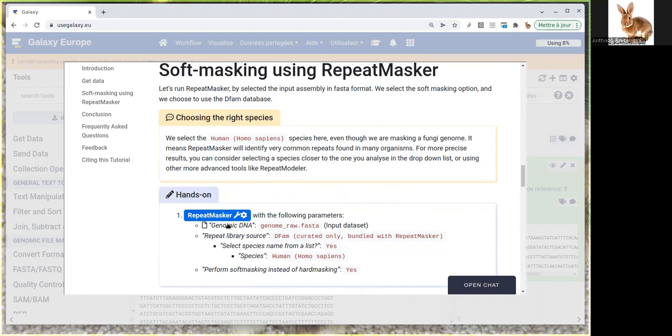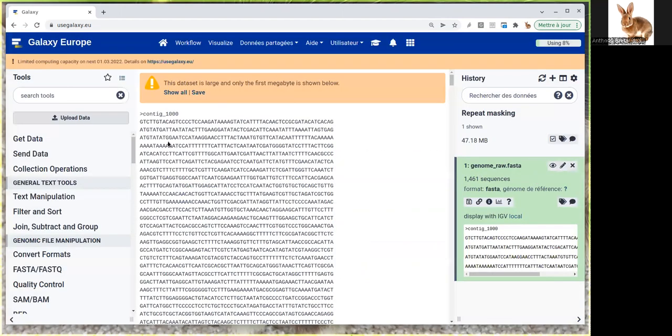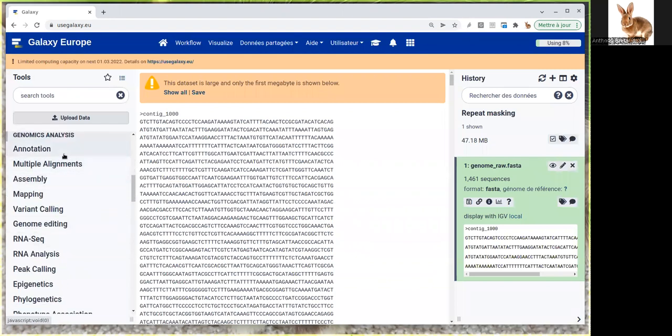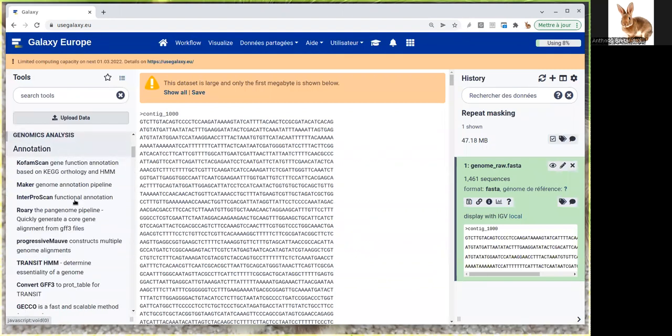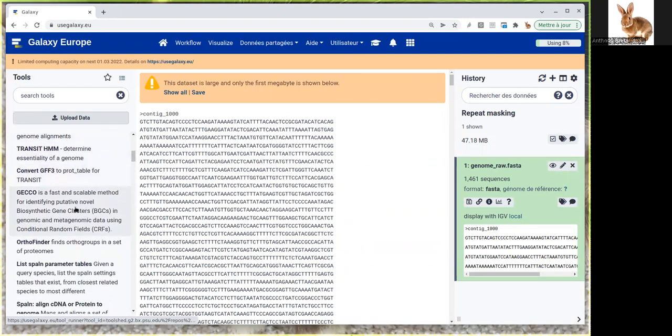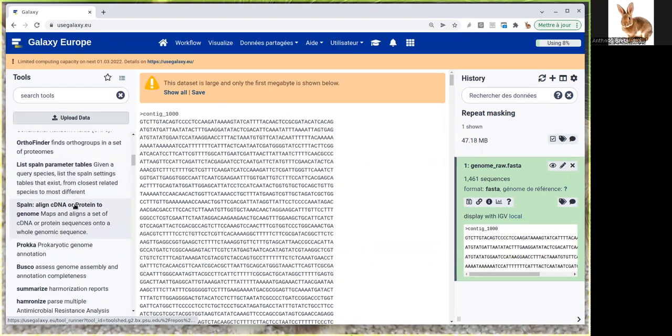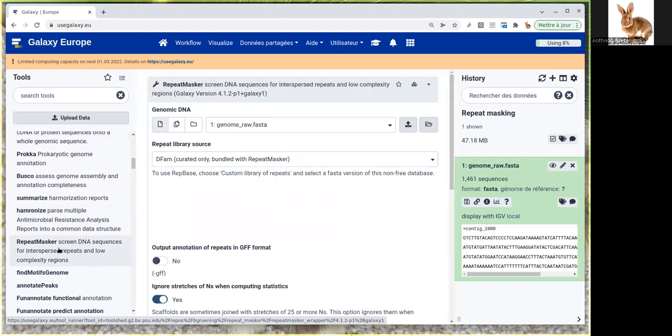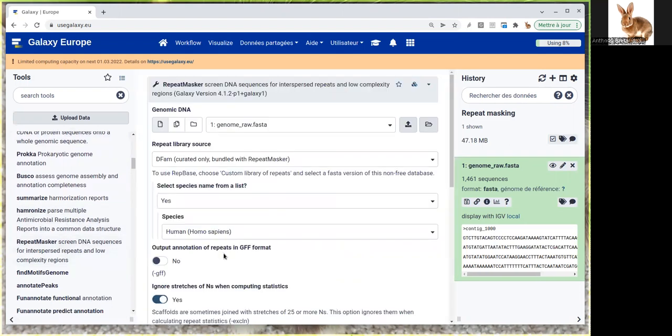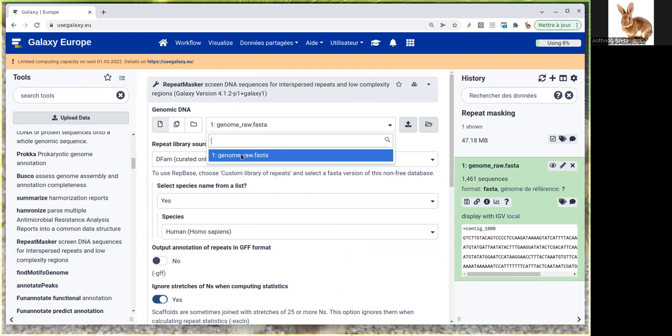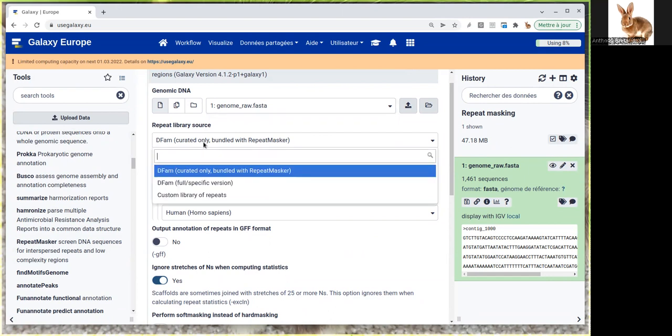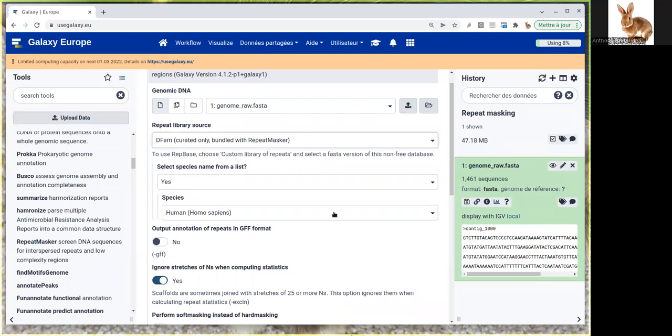The next step is to run RepeatMasker on this genome. You can launch it by clicking here or find it in the annotation section. We're using the latest version, and we'll select the genome sequence. RepeatMasker uses a database, so we're going to use DFAM, the one bundled with RepeatMasker.